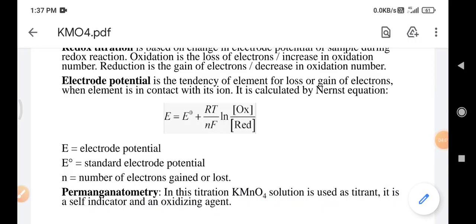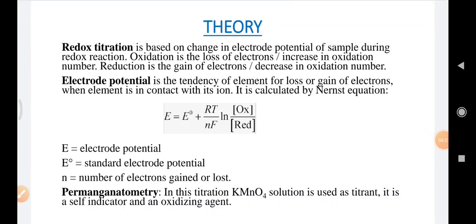It is important to note that KMnO4 solution is unstable in acidic and basic medium, so it must be prepared in neutral medium with distilled water free from any impurities. It is then boiled for 15 to 20 minutes, cooled at room temperature, filtered, and used for titration. KMnO4 is used as a self-indicator — it produces a pink color at the end point, so no additional indicator is needed in this standardization procedure.